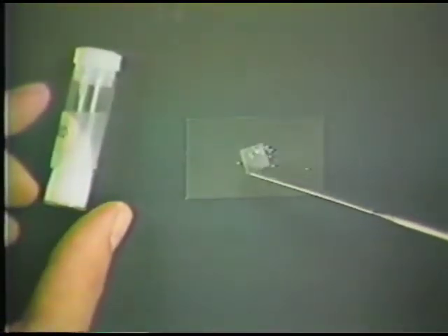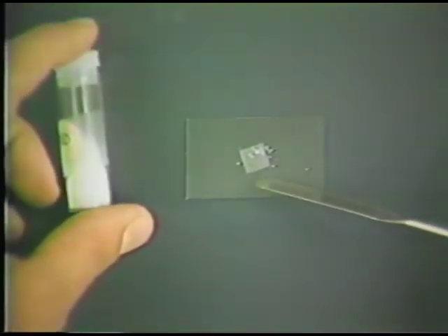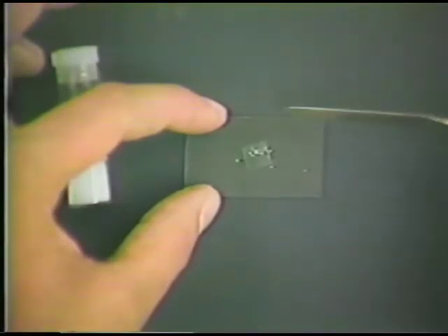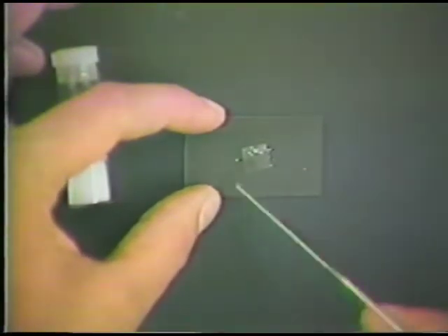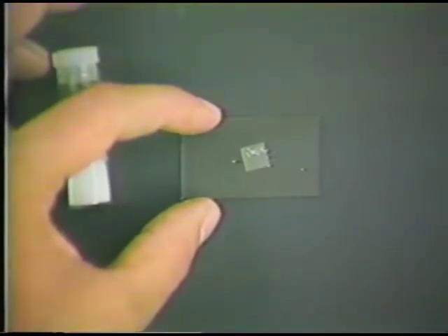You can see the vague white forms here, and I put them on a glass slide together with a tiny cover glass. This cover glass is meant to control the upper surface of these grains, so I can manipulate the grains so that they're covered largely by the cover glass in this kind of orientation.